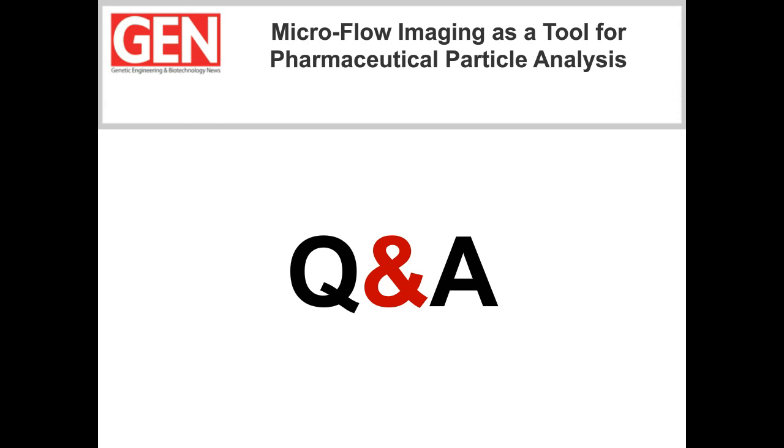Miranda, one of our audience members would like to know, they state that in the webinar you showed that MFI has major advantages over optical microscopy and laser diffraction for the characterization of PLGA microparticles. Could you also share with us some limitations of MFI? Yes, sure. That's a very valid question. In my presentation, I've highlighted the key advantages of MFI, but indeed MFI also has its limitations.